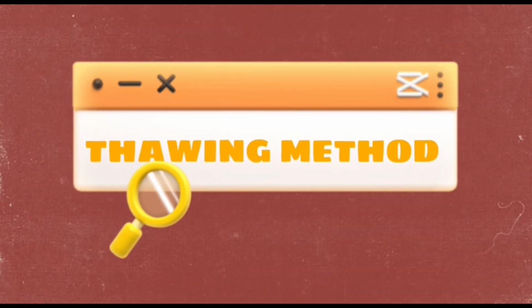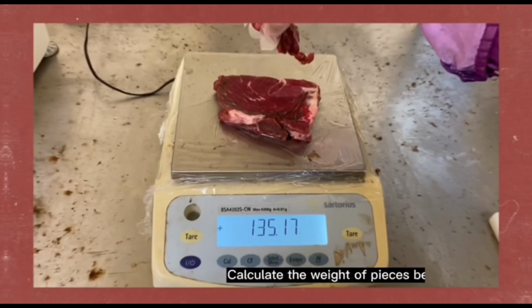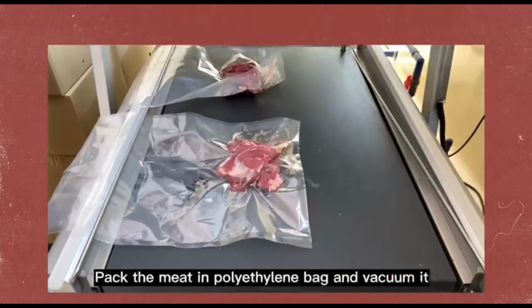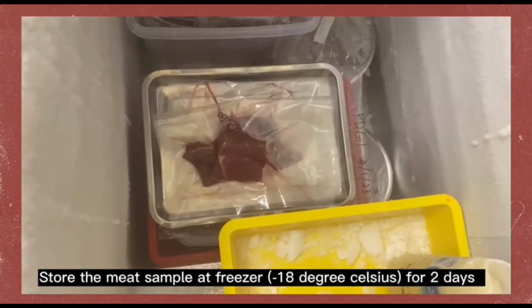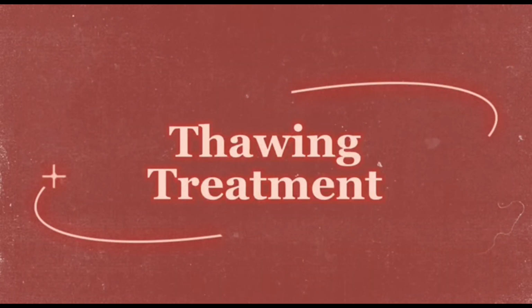Thawing method. Sample preparation. Calculate the weight of the pieces before thawing, W1. Pack the meat in a polyethylene bag and vacuum it. Store the meat sample in the freezer at -18 degrees Celsius for 2 days. Thawing treatment.